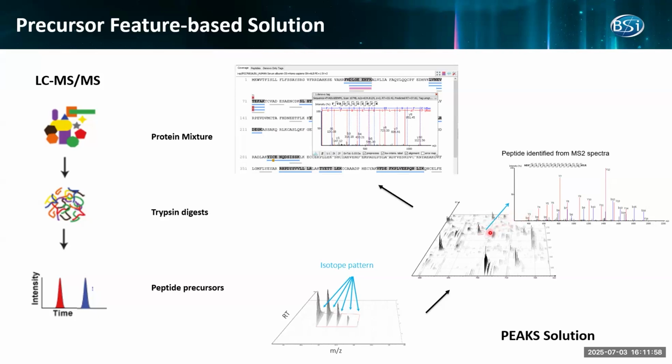If there is a co-eluted precursor, the chimeric spectra algorithm will take care of it. The software will assign this chimeric precursor to the spectrum. Finally, we get the identification of those peptides, summarize all the peptides and use a parsimony algorithm to infer the proteins. Finally, you get a protein list, which shows the coverage by supporting peptides.